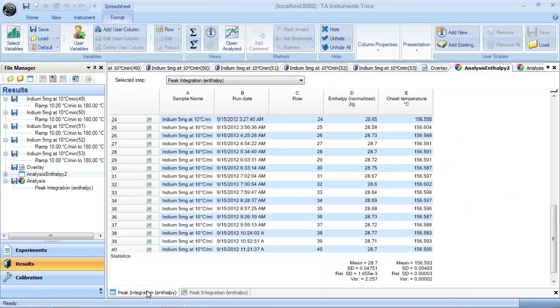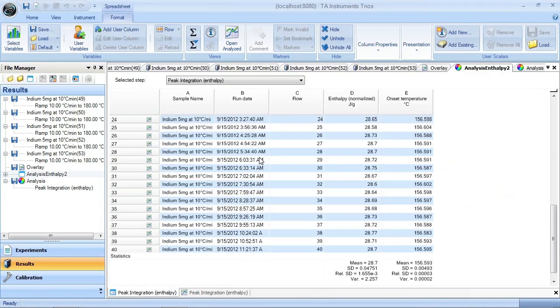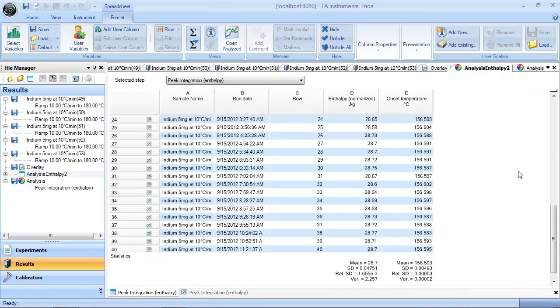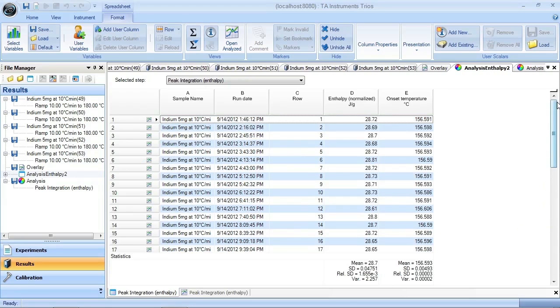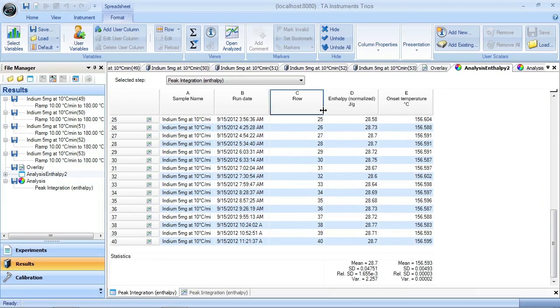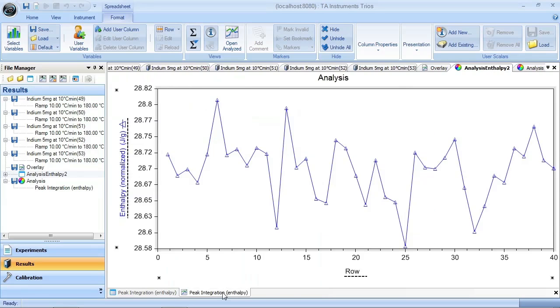Here I've got all 40 runs you can see, from one to 40. You can take columns of data, you can get statistics on them. So you can see my average is 28.7, but my relative standard deviation is 1.65%.